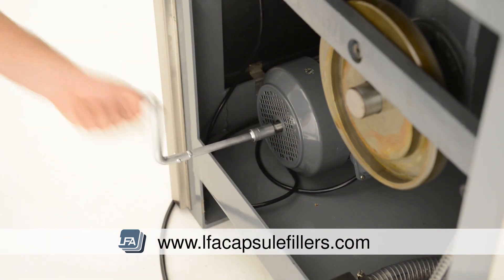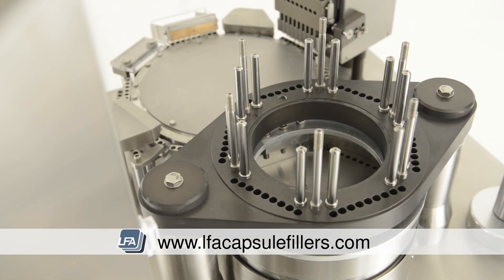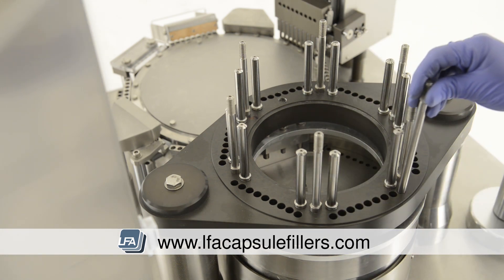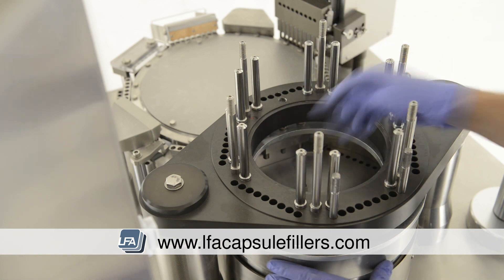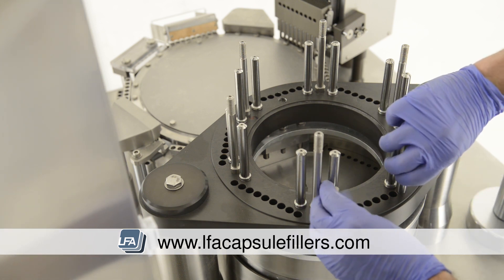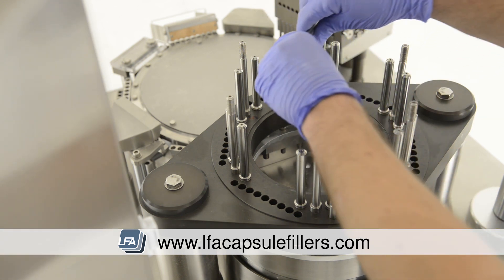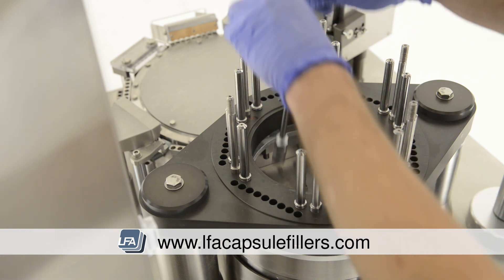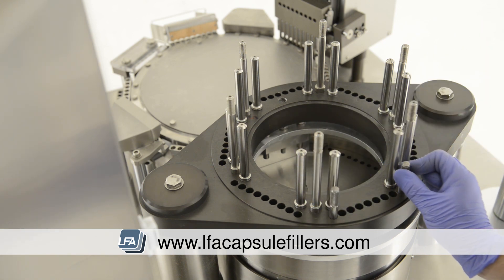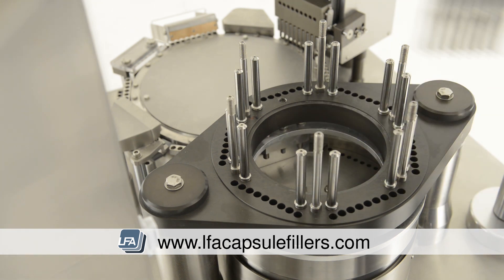Rotate the machine by hand so the tamping turret is at the lowest point in the cycle. Take your alignment tools and place them at either end of the station. Adjust the bottom section until the alignment tools fall into place — ensure they are loose and able to move freely. Use the special tool that came with your FACF and tighten the bottom section in small, equal increments. Check the alignment tools periodically to ensure they're still moving freely. If the alignment tools are catching and rubbing, simply loosen the bolts at the bottom section, adjust, and redo.